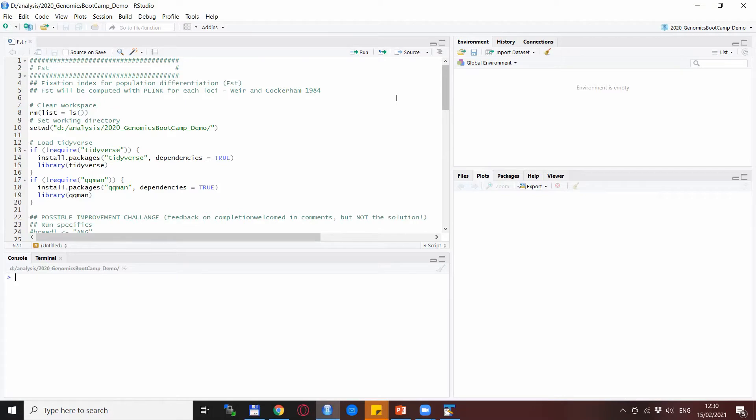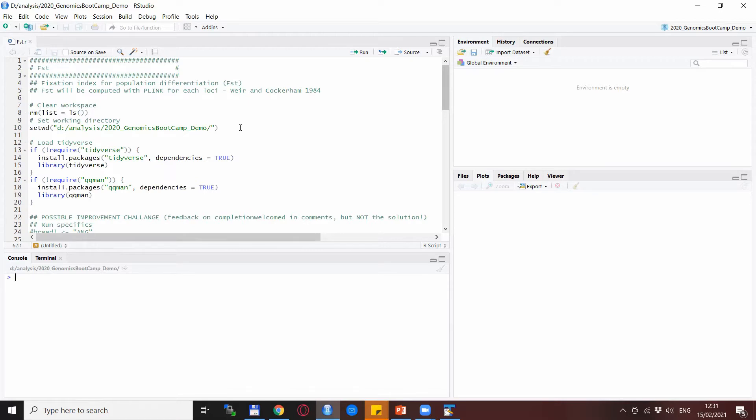Here we are in R again to do the FST analysis—the fixation index for population differentiation for each of the SNPs between the two selected populations. The FSTs will be computed by Plink for each loci according to the Weir and Cockerham method 1984, as documented in Plink.